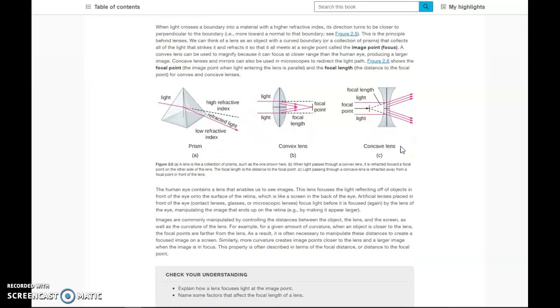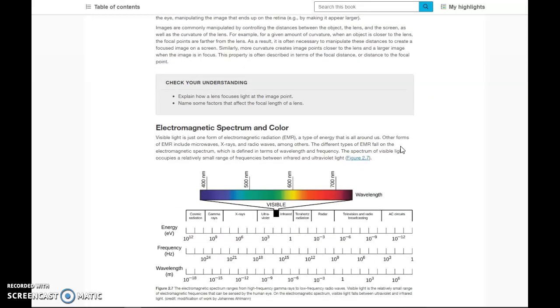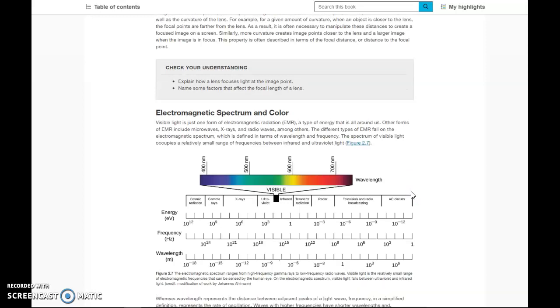So microscopes are built with this idea in mind, knowing that we are going to have to overcome this refraction and the diffraction and reflection, that we're going to have to overcome these different things. Microscopes are built for us to best be able to overcome those issues and view the specimen as it really would be.